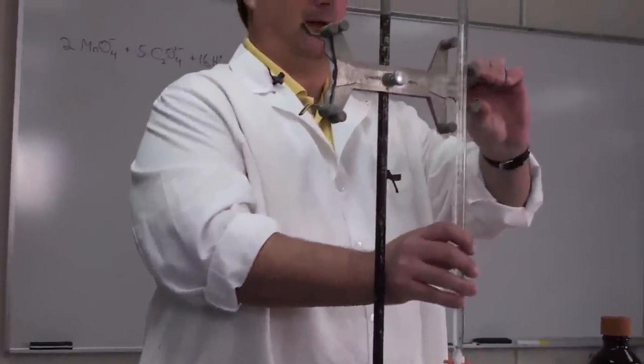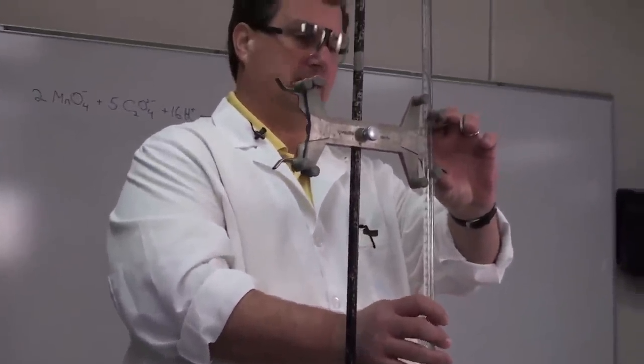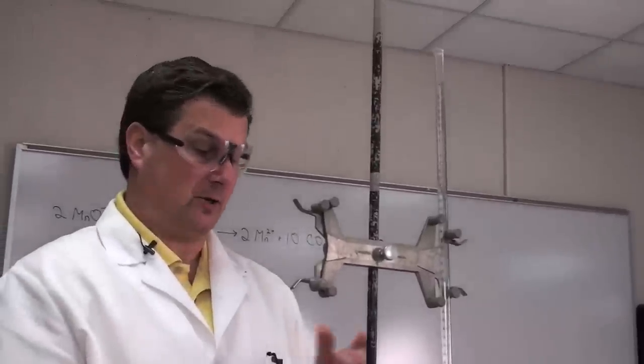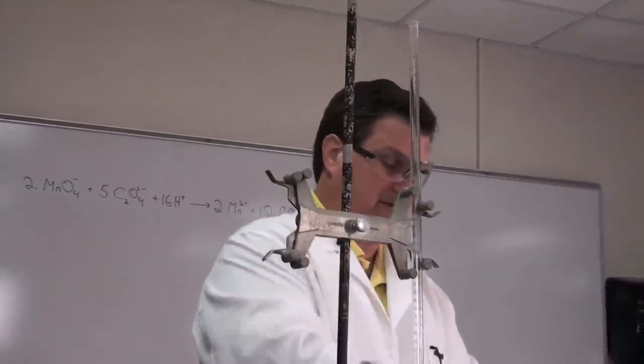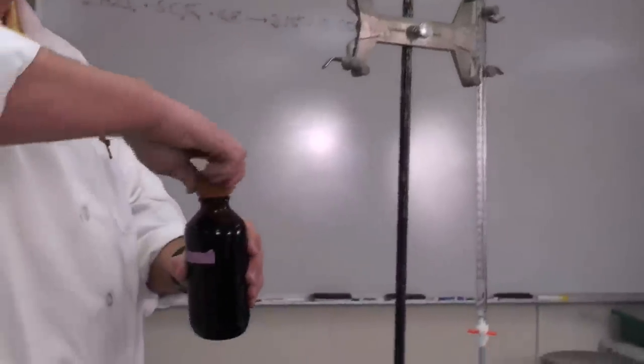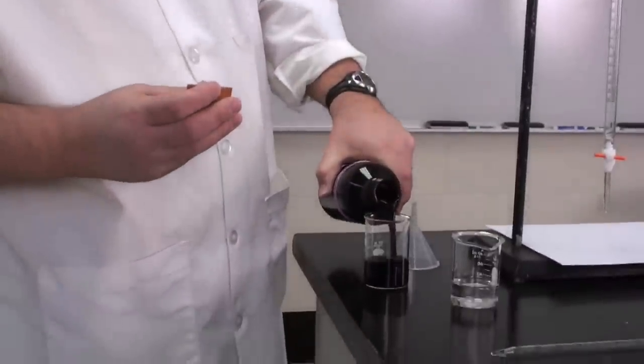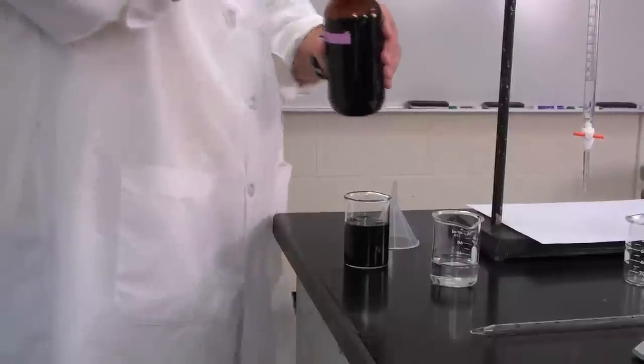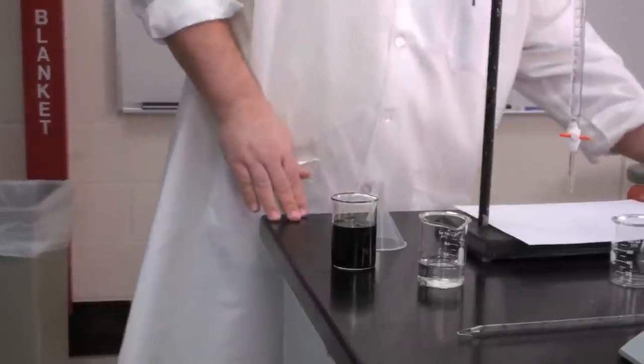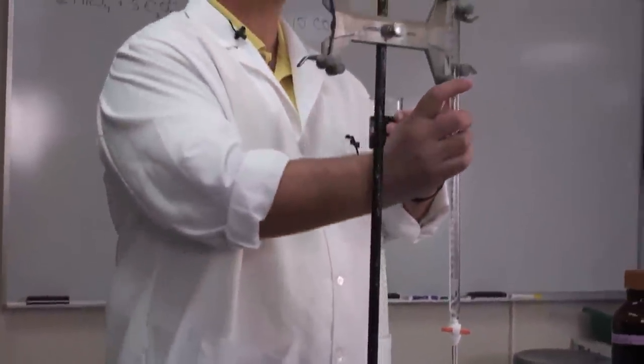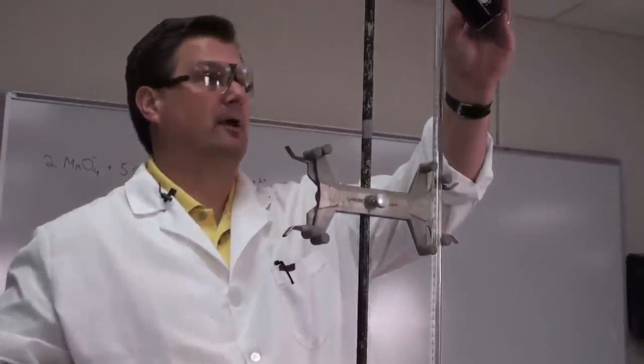Putting solutions into a burette—different people do it different ways. If you have a very steady hand, you can pour it directly in. Some people like to use a funnel. I'll show you the way I like to do it. Again, we'll get a little bit of this stuff and put it into a separate beaker. It's much easier to pour out of a beaker. If you have a steady hand, and I like to think mine is somewhat steady, you can just pour it straight in.